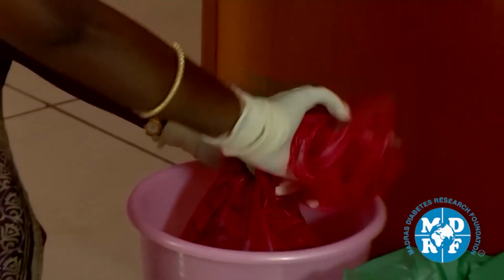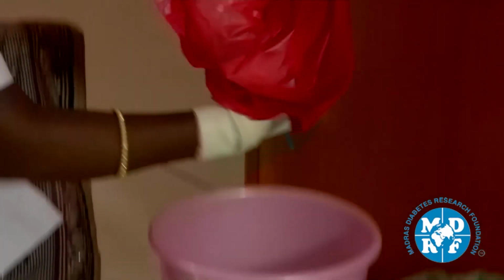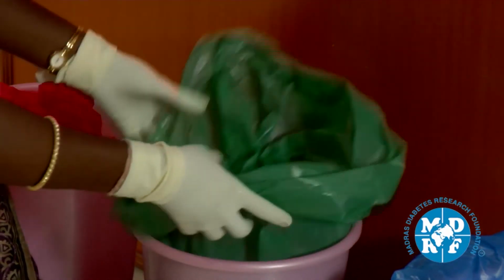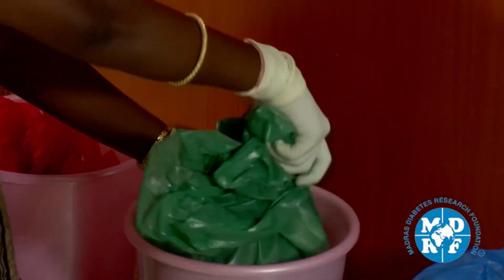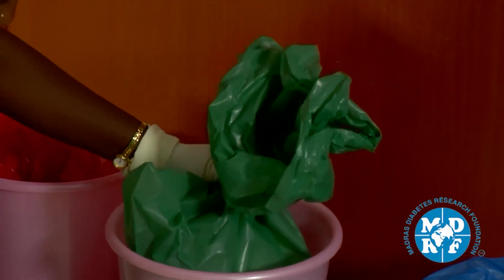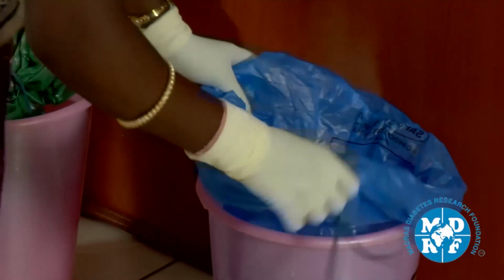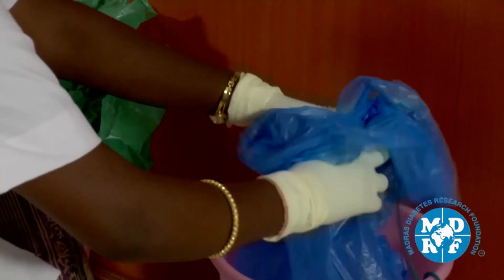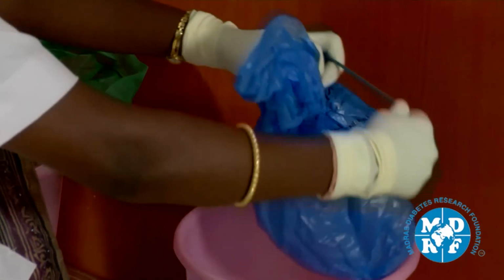Waste disposal. This session of the video deals with disposing the biomedical waste. The biomedical waste includes used vacutainers, used needles, used pipette tips, used glucose meter strips, used lancets, used cotton, and used gloves. The biomedical waste should be segregated as per the specified guidelines. All biomedical waste should be segregated according to their type and dropped in the respective color-coded bags only.